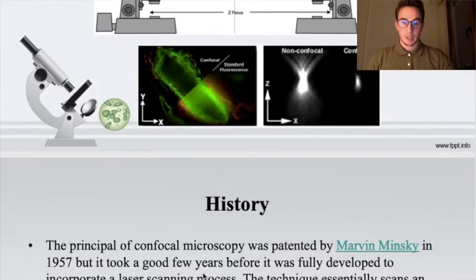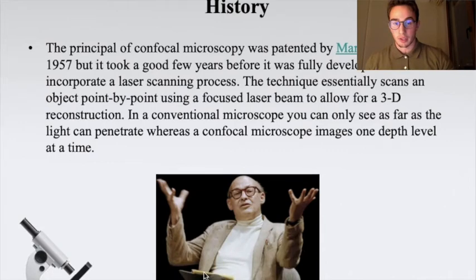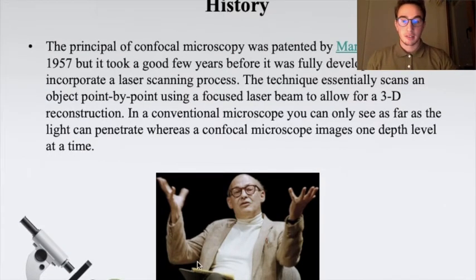And what is the history of confocal microscopy? Marvin Minsky invented confocal microscopy in 1957. The technique essentially scans an object point by point using a focused laser beam to allow for a 3D reconstruction, as I said.